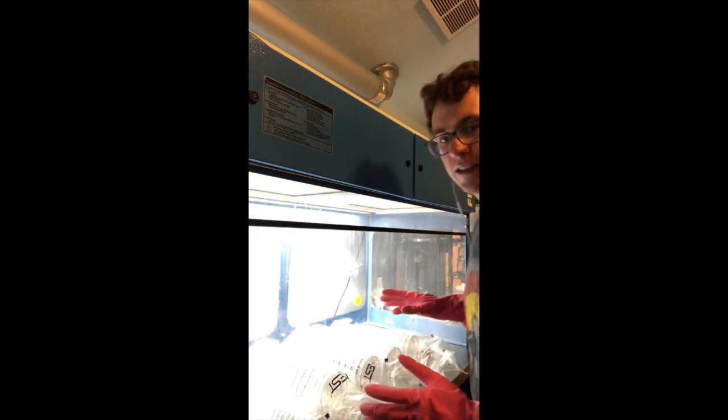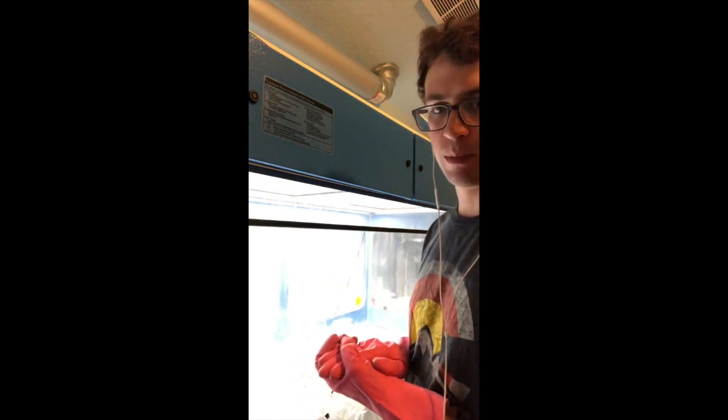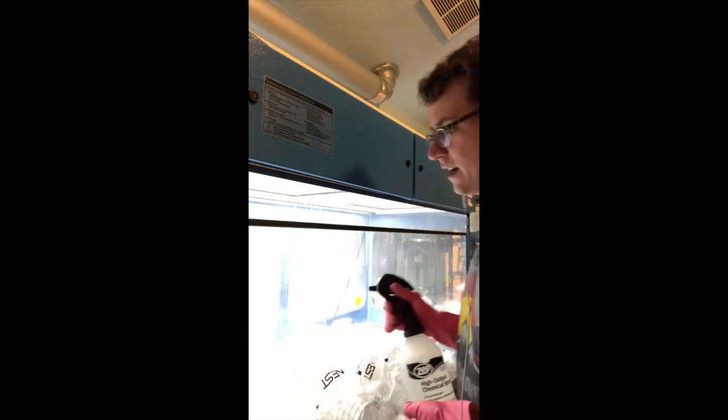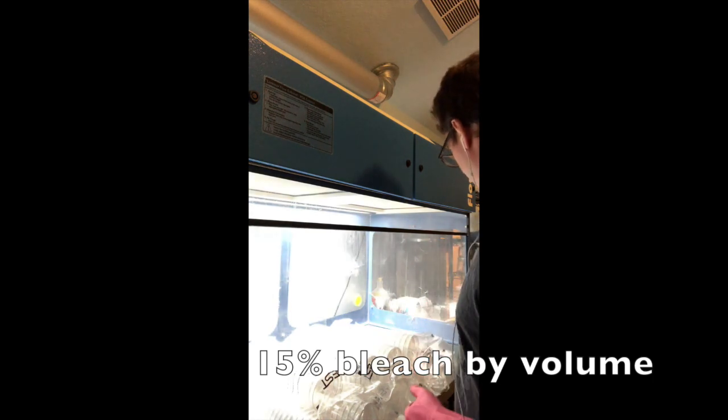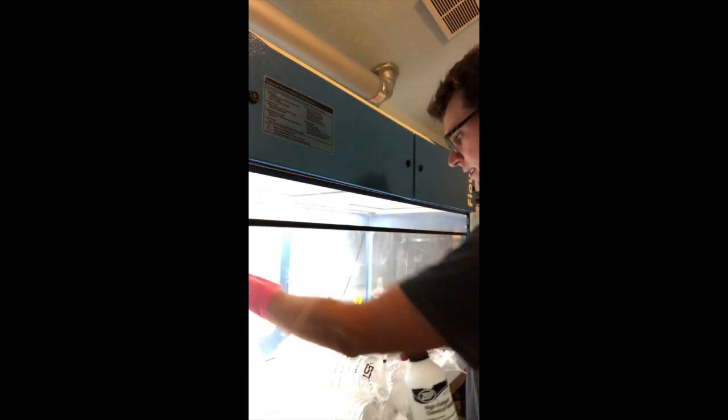When you're pouring plates, it is very important to give your hood a thorough bleaching and wipe it clean with alcohol. Also, even though these packs are sterile, I like to spray the outside with bleach just to be, you know, extra safe. So this is a 15% bleach, and I just spray the entire hood with that to give it a nice coating, and then I'm just gonna go ahead and spray all these plates.